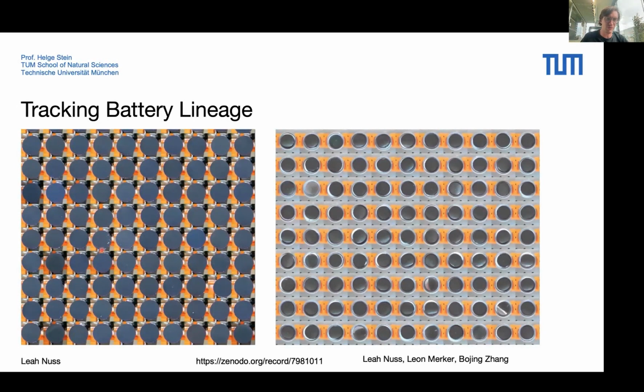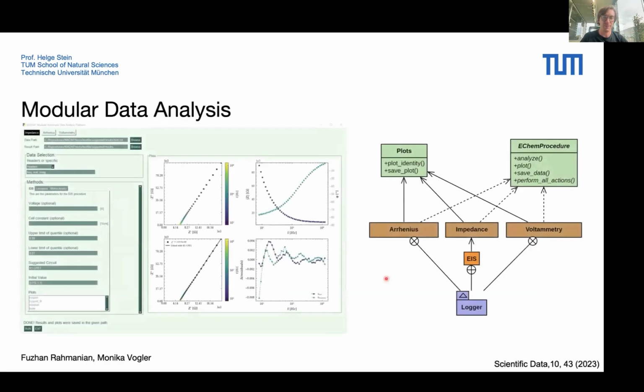There's, of course, one thing of saying, okay, I'm planning this, and maybe you can see this slightly purple ring here. You always need to control how well you actually then later place the electrode, because it could also be like, for instance, here, if something goes wrong, you should always be able to track it back to the actual data point.